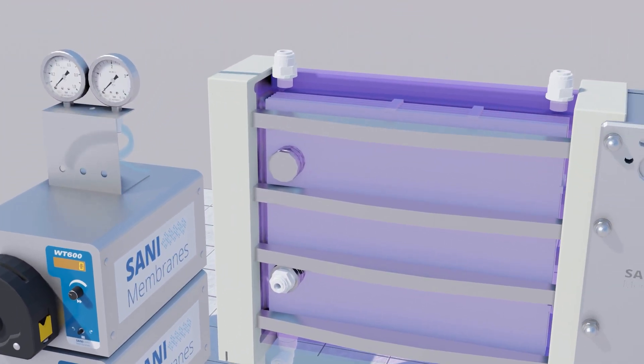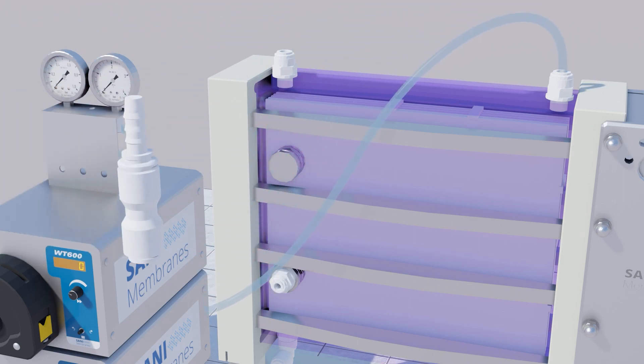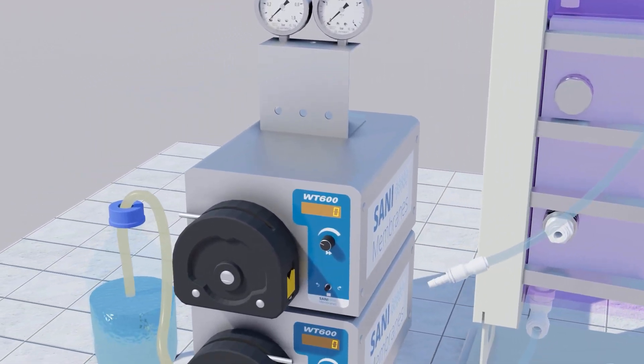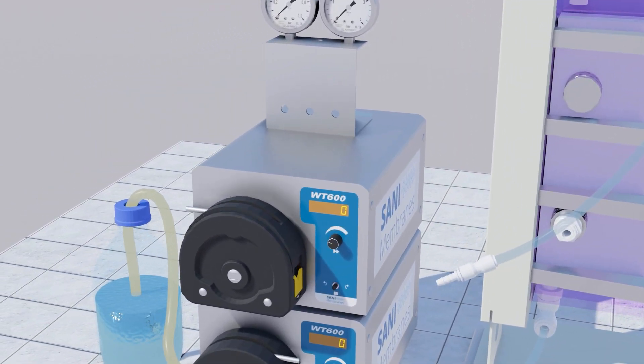Diagonally opposite of the used inlet port, connect the 8mm tubing to the outlet, fit a hose barb adapter and connect it to the pump tubing.